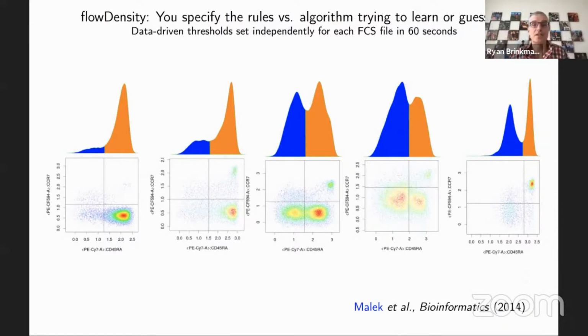and then you take your hands off, and the algorithm works. This is different than an unsupervised algorithm, where if you're using machine learning, the algorithm is trying to learn what you're trying to do, or if you're using an unsupervised algorithm you have to tune parameters that you have to guess what those parameters are, and then the algorithm is trying to fit models to the data. And one of the reasons why these unsupervised algorithms are never going to, I think, get the performance that we can get with the supervised method is because in an unsupervised method, you have to make assumptions about the size, shape, and distribution of all the different cell populations you're going to see in a data set.